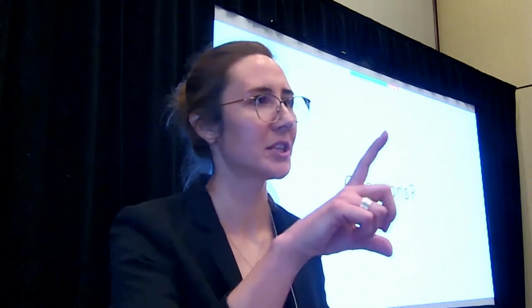You just mean after aligning? Yeah. I think a lot of it comes down to, first of all, if there are repetitive regions, it might align somewhere else, and so it gets split across, even though it might have originated from that portion. The aligner doesn't know that, right? And so it might be aligning it elsewhere. It could also be that your reference is different from your reads a little bit. So unless you created your own reference out of the RNA-Seq reads, there could just be SNP differences, and the aligner is possibly not going to align as well if there are too many differences in that region.